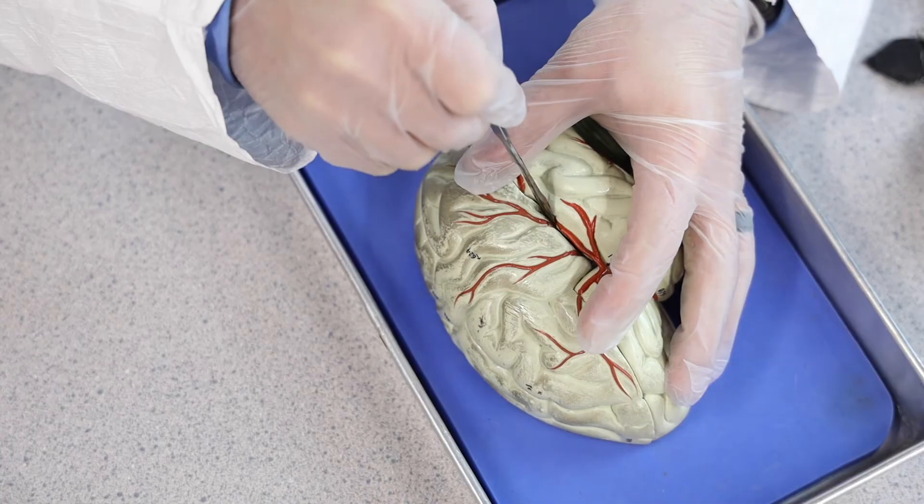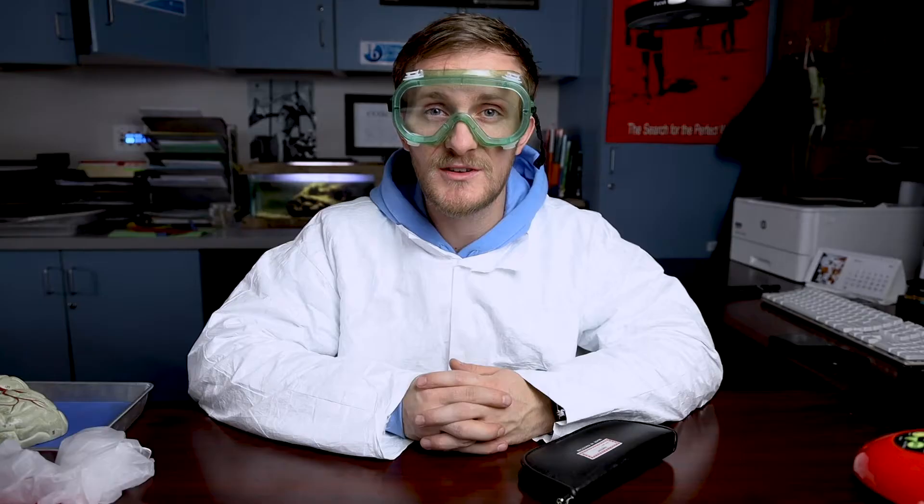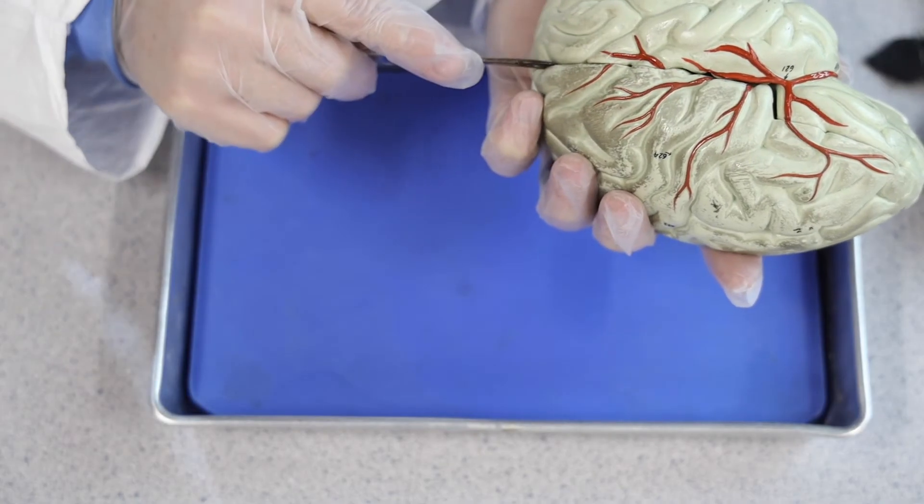Step number two: safety during the dissection. The tools you may use during a dissection are non-discriminatory — they will gladly cut through a brain, heart, or your finger, so make sure you're handling them with care. When you make an incision, be sure to make the cut away from your body and the body of others in your dissection group. Do not ever hold the dissection specimen in your hand and dissect at the same time — that's just asking for trouble.